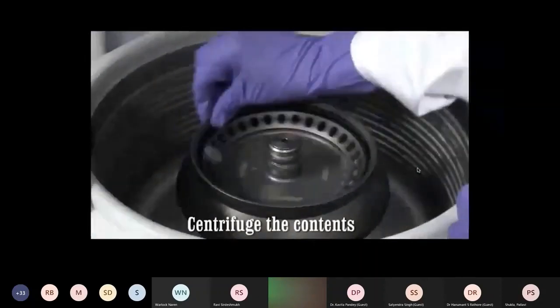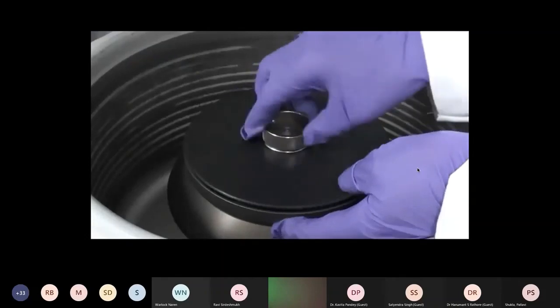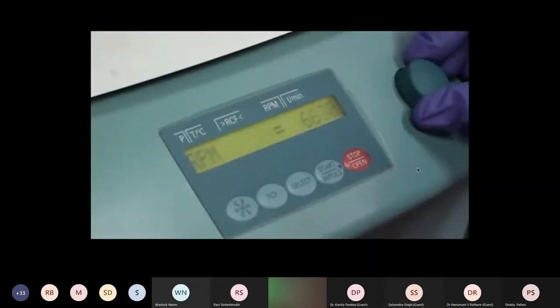Centrifuge the sample at 10,000 rpm for 5 minutes and maintain a temperature of 4 degrees Celsius during the process to ensure that there is no denaturation of the proteins.